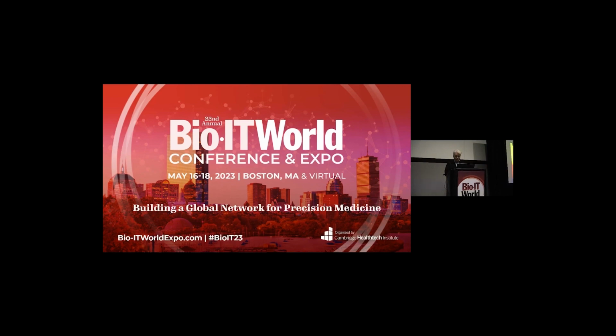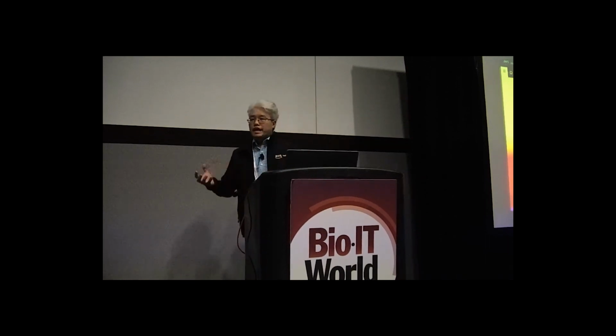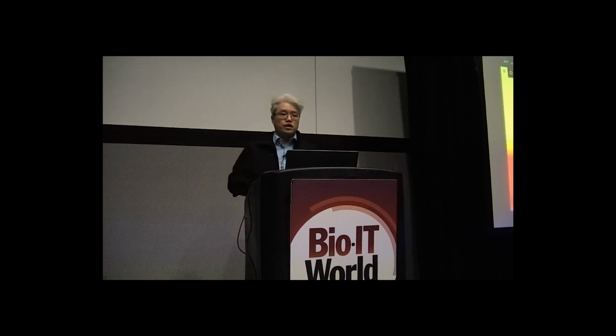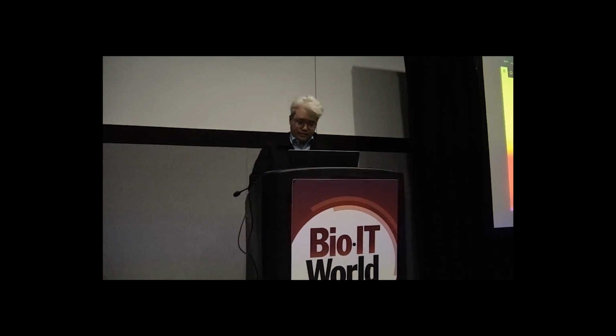In the first step, we're going to import a reference genome. Normally, if you've never come to Omics before, you might have to create a reference store. We've already done that for you to avoid confusion. But if you go home and want to try this on your own, the AWS console will probably tell you to first create a reference store. After you do that, you click the orange button that says Import reference genome, and it already has the reference store we have in this particular account.